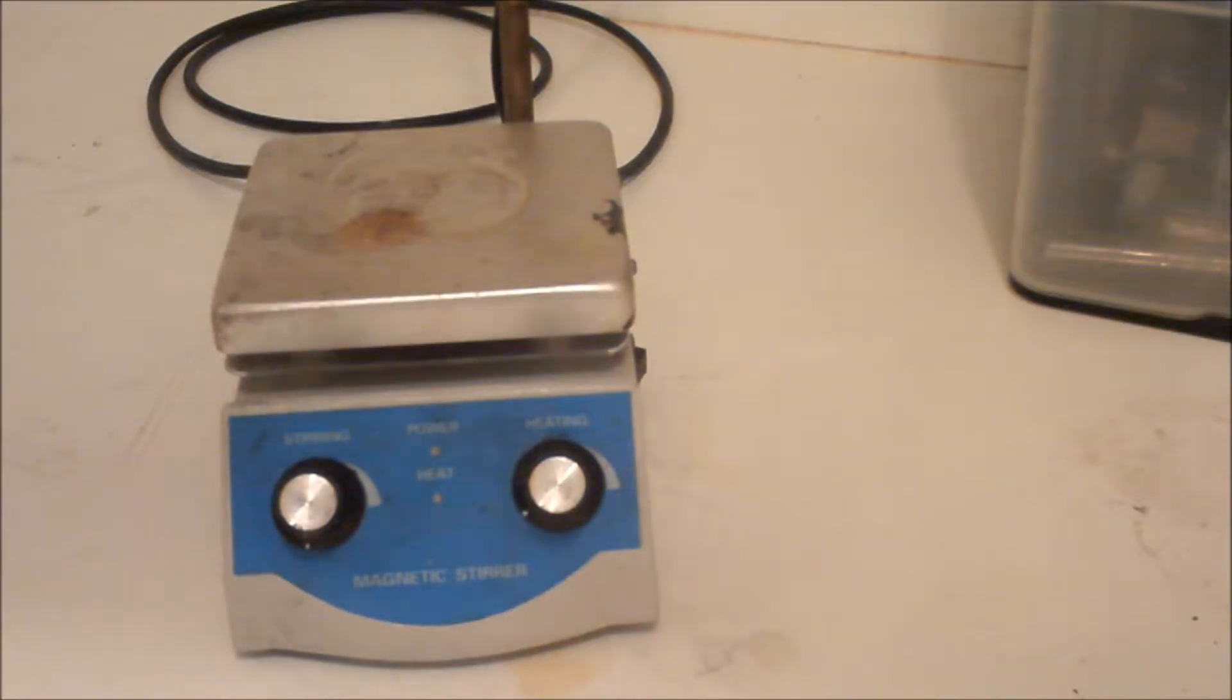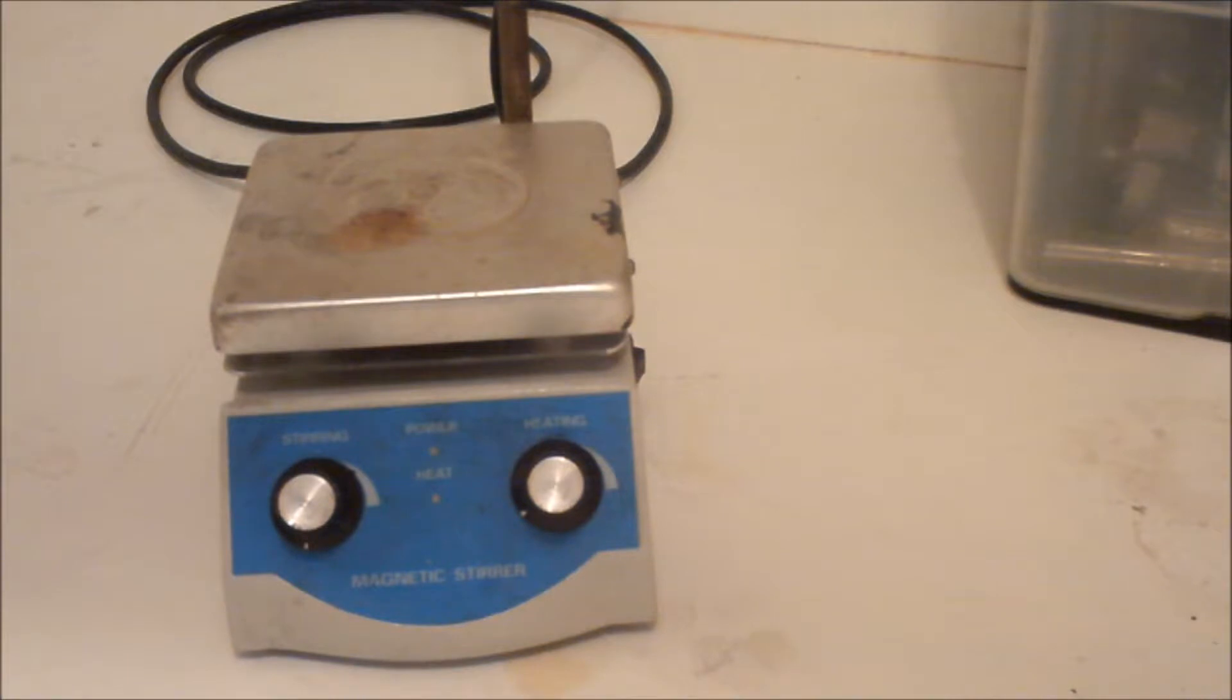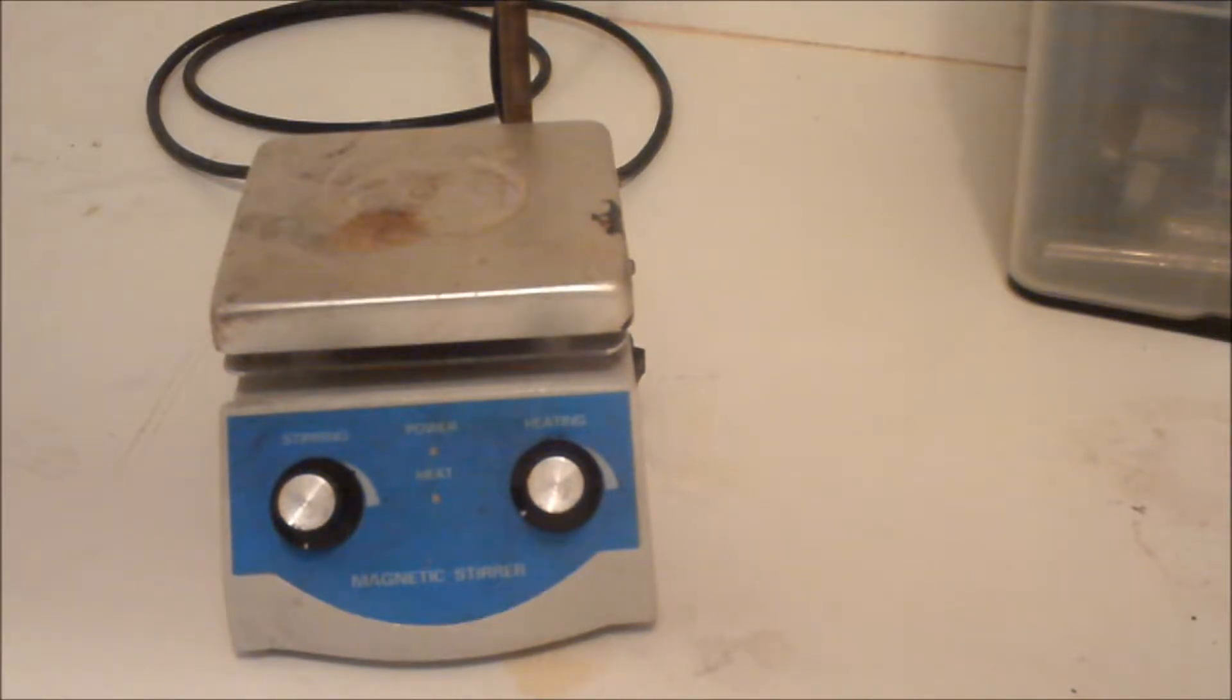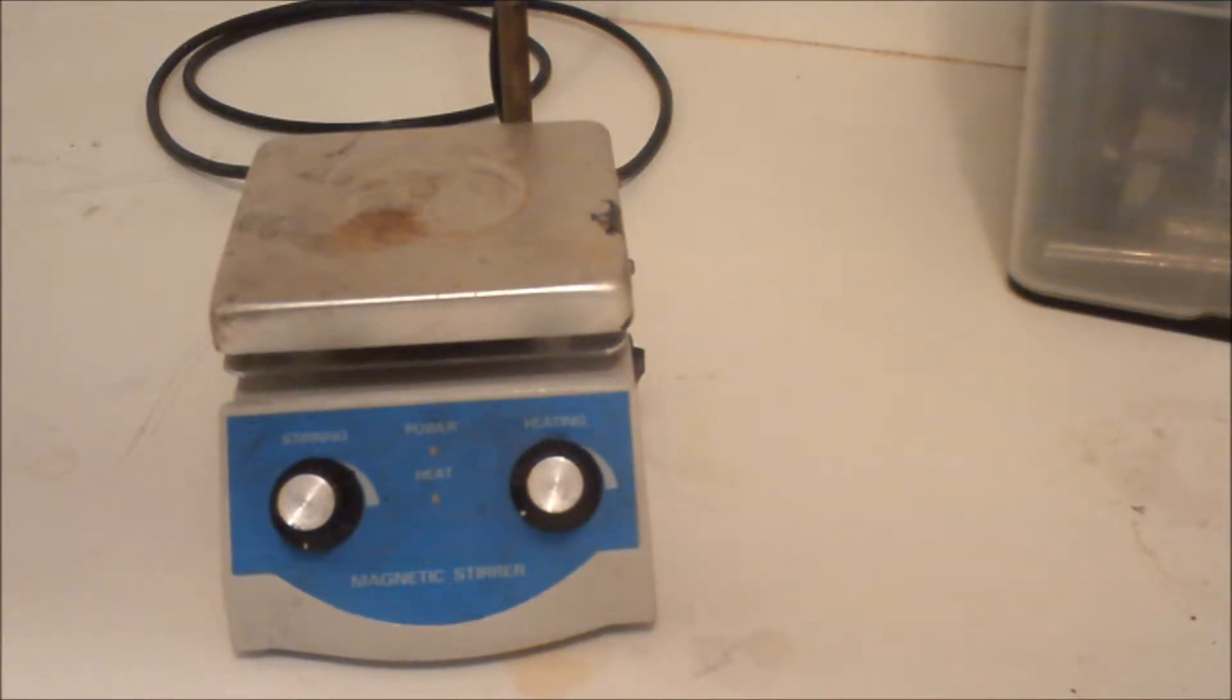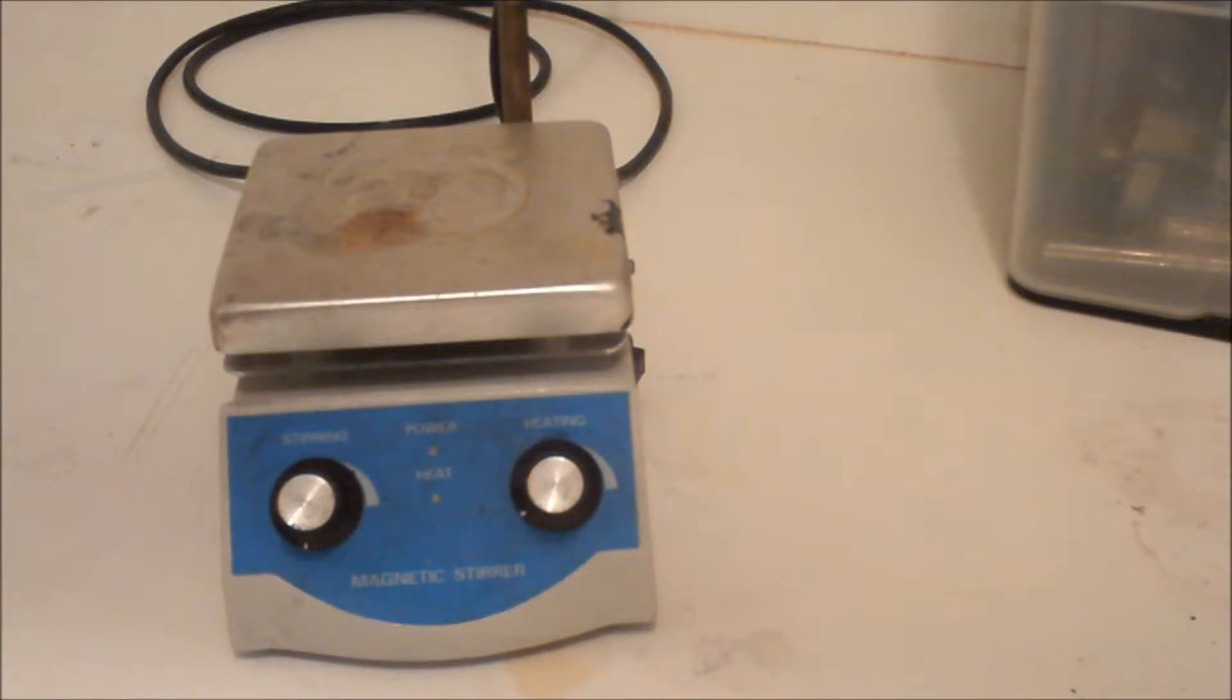When using nitric acid, you get nitrogen oxide fumes which are very hazardous, so do this outside or in a fume hood. Let me just put on my gloves. Whenever working with any acid, you always want to have something to neutralize it with so it doesn't ruin everything.